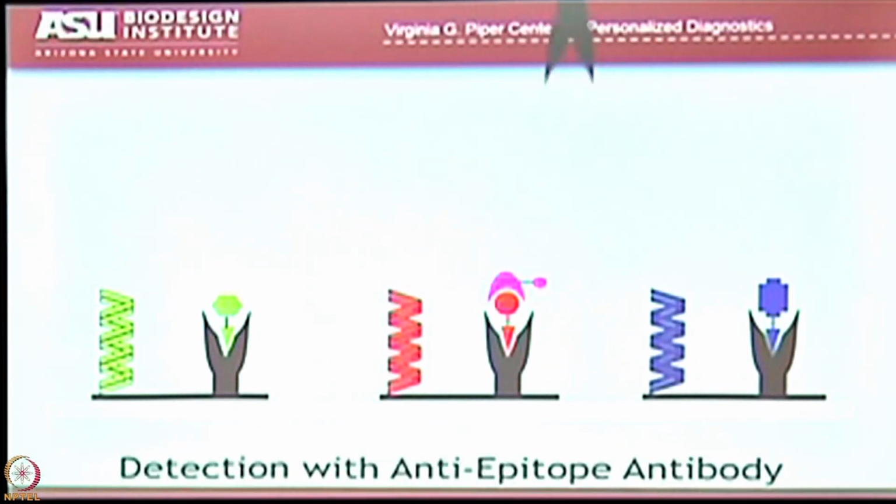Right? And I can detect that interaction with an antibody that has a fluorescent marker on it that will recognize either a tag on the pink protein or it could recognize the pink protein itself. Now, there's all kinds of variations you can do here. You could use click chemistry to look at interactions, and we've done that. You can have other molecules that interact with this guy, avidin and biotin, lots of different strategies. But the bottom line is, as long as you can recognize the query protein, you can determine where the binding occurred.